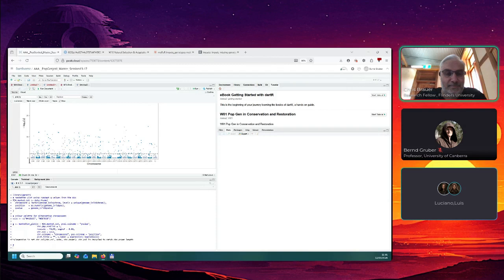You can generate that from a VCF file, and then you can use the Q values or whatever approach you use to define the candidate loci on the y-axis, and then it will just plot.